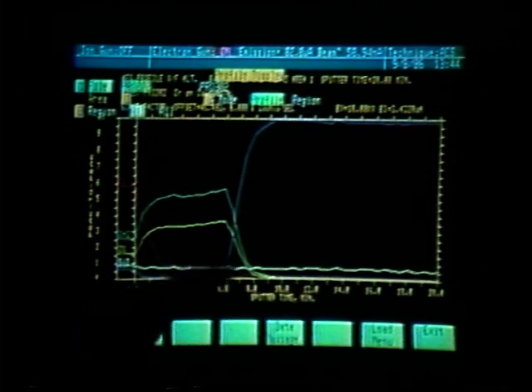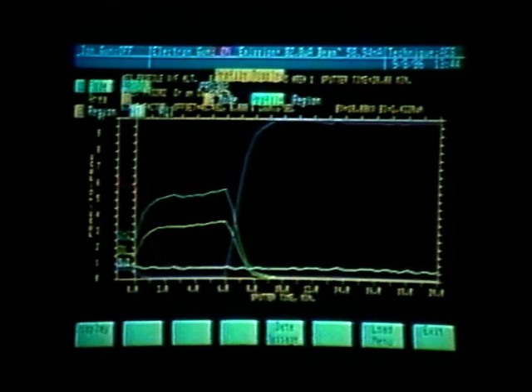Here we see the peak-to-peak height values of the elements which we monitored in the profile. The first one is carbon. The second one is chromium in blue. The third one is oxygen in green. We also see silicon, which here is displayed in a gray, and the copper, which is displayed in purple.